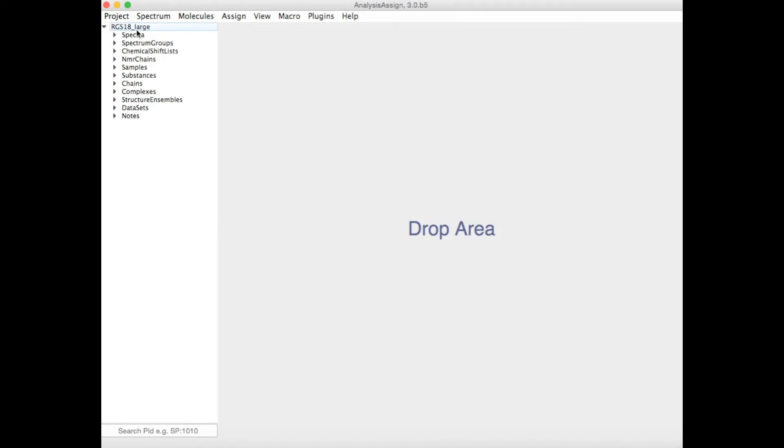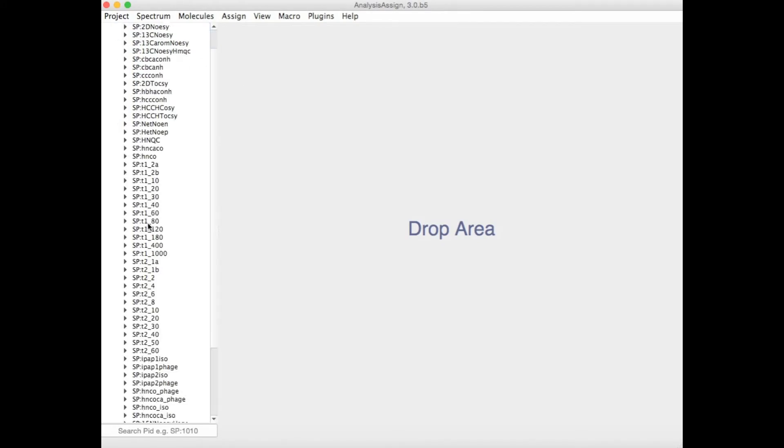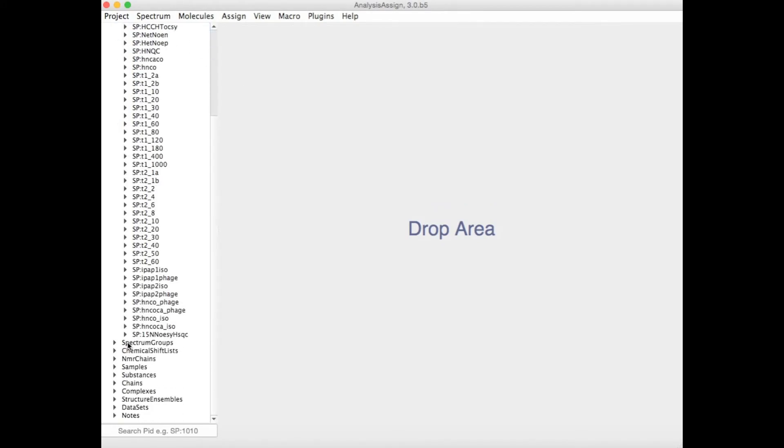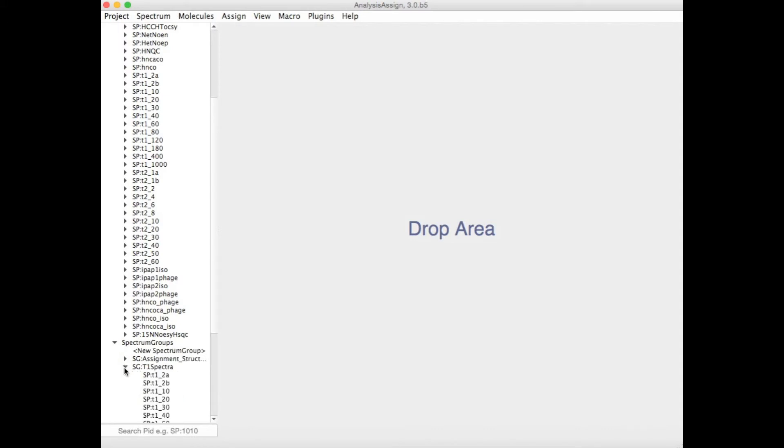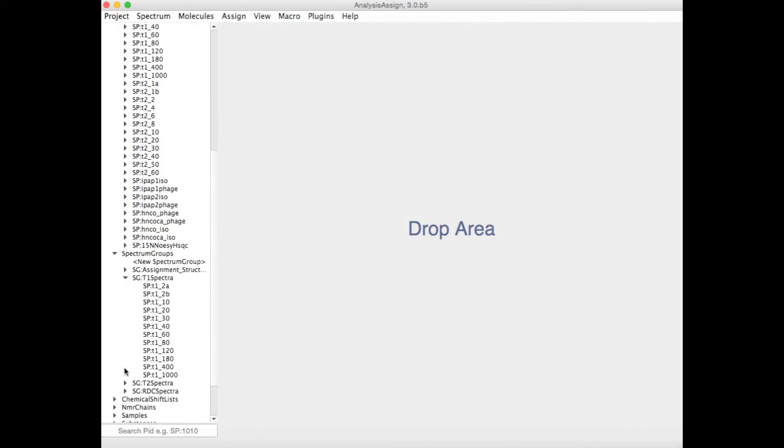Do you have a project with a lot of spectra in it? Simply place them into spectrum groups to keep them organized or to create a series for easy data analysis.